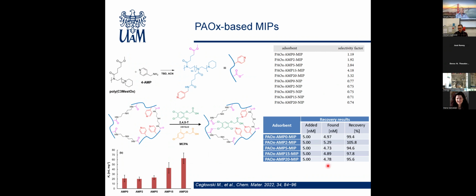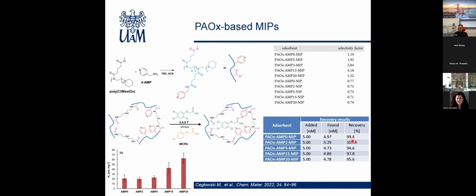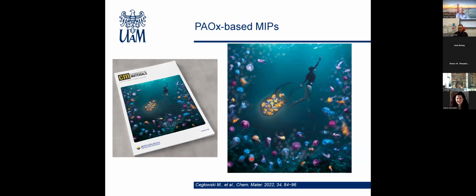And we, of course, made the FAPA quantification, ambient MS quantification, and showed nice recovery values within 6% of the true value using the river water sample spiked with 245T. Actually, the results were quite nice. We were allowed to publish it in Chemistry of Materials, and we were even asked to prepare a cover.